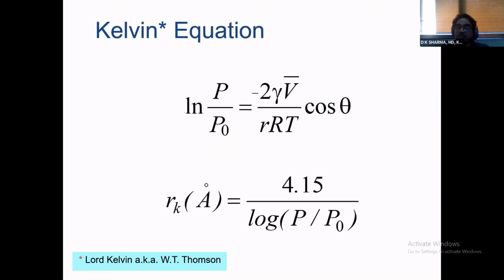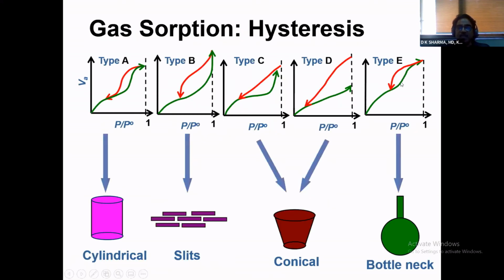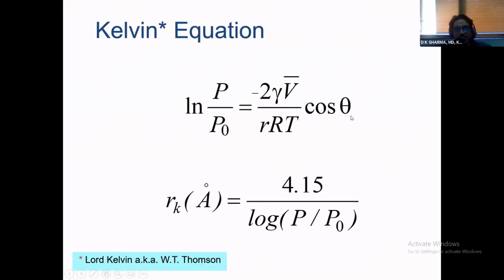Actually, the pore size is calculated by using the Kelvin equation to find the width of the central core, which means the capillary condensed core. The total pore size is this central core plus the multilayers that have been adsorbing on the walls.